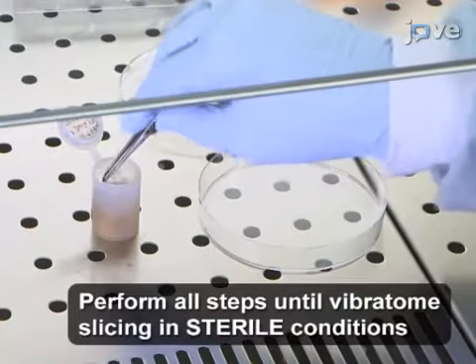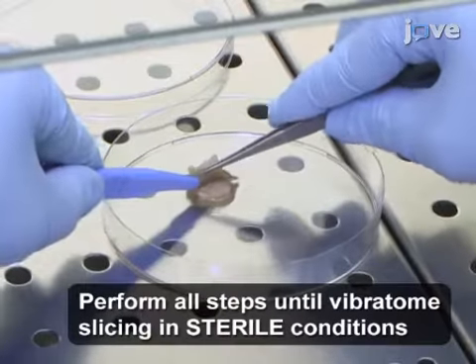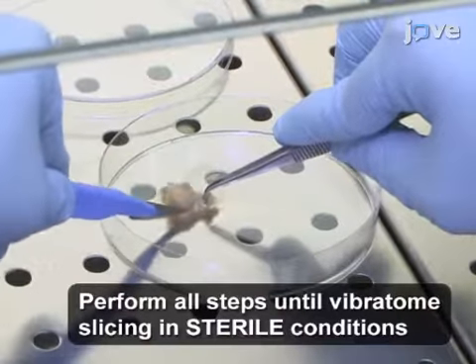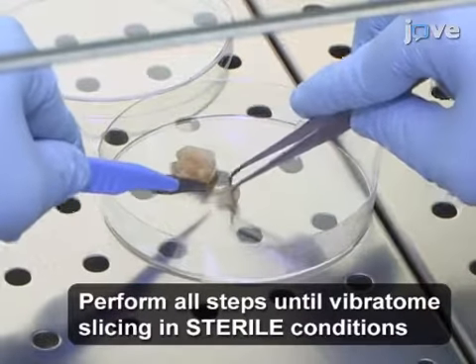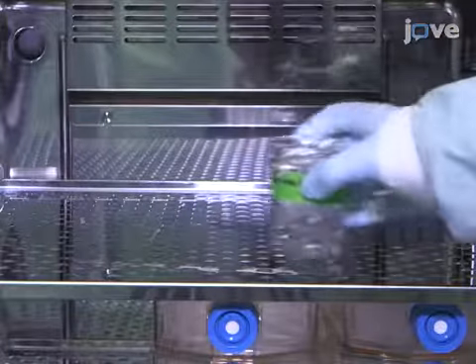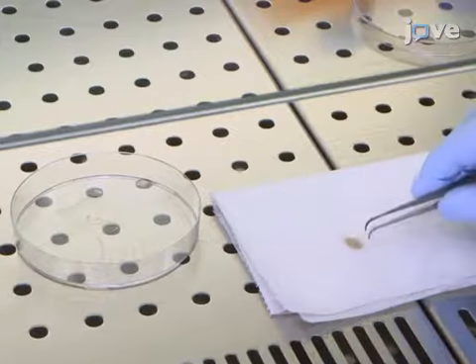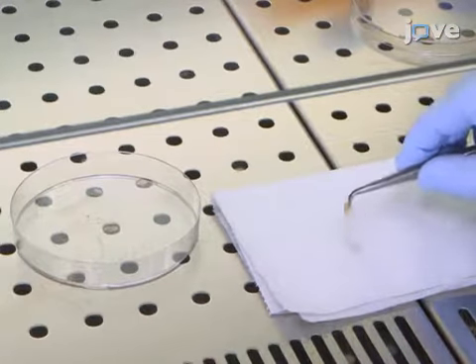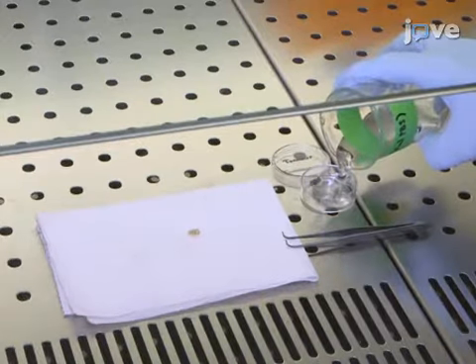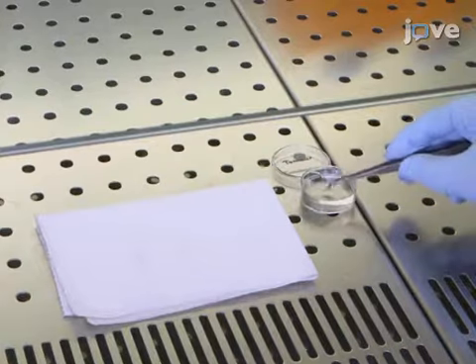Next, place the tumor biopsy in a 10 cm plastic dish, and using a sharp sterile blade, cut the tumor into a small cube-shaped fragment that is approximately 5 by 5 millimeters. Now, take out the prepared agarose solution from the incubator. Using a pair of sterile forceps, carefully transfer the tumor fragments to a tissue wipe to drain out excess medium. Then pour the agarose into a 35 mm plastic dish and insert the tumor fragments so as to position them at the bottom of the plastic dish.